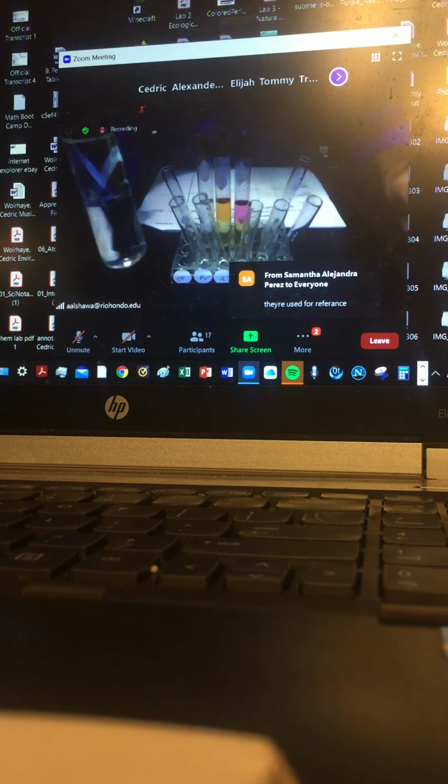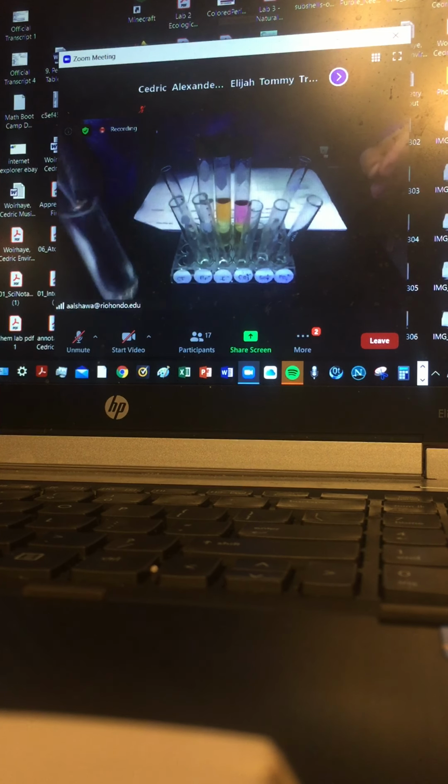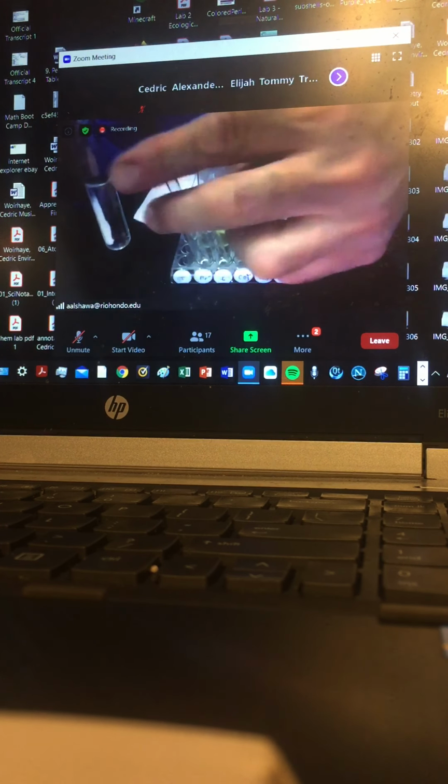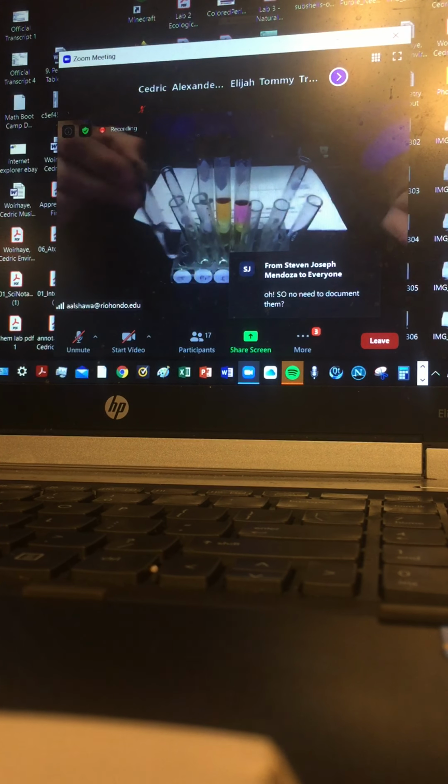There are 2 layers. You can tell them apart, right? So I can just mix and make sure they're mixed. The 2 layers are meant to be isolated. And here's the color of the hexane. The top layer is the color of the chlorine in the hexane layer.